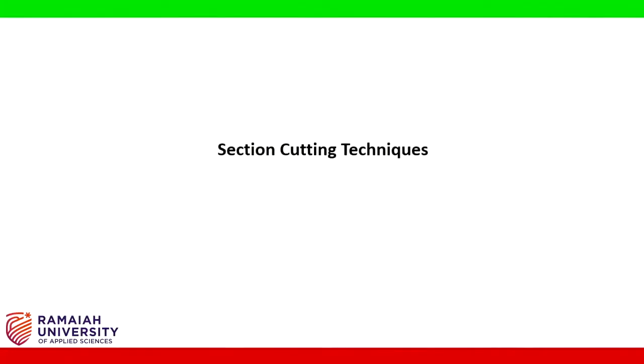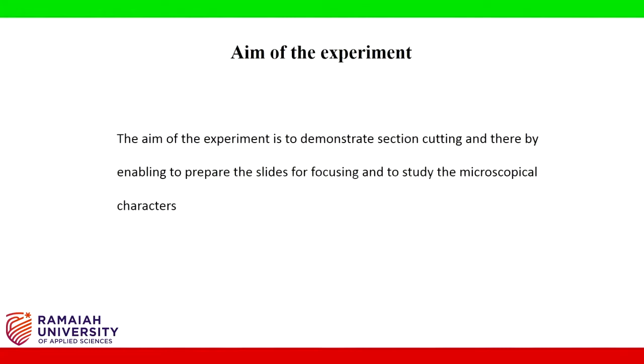Hi students, today we are going to learn about section cutting techniques. Aim of the experiment is to demonstrate section cutting and thereby enabling to prepare the slides for focusing and to study the microscopical characters.